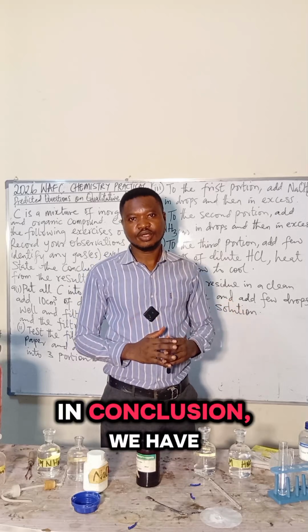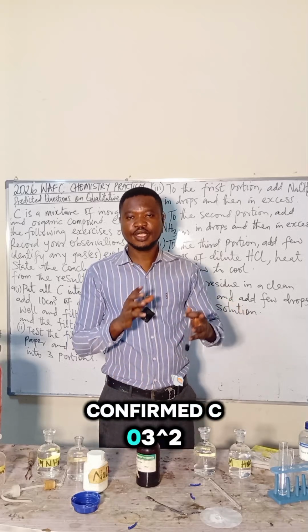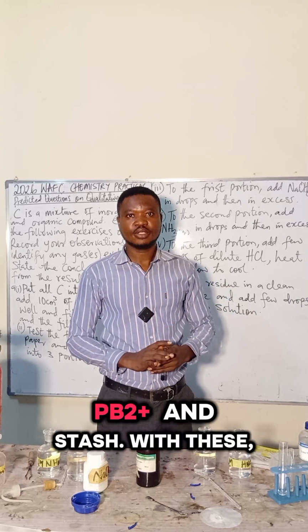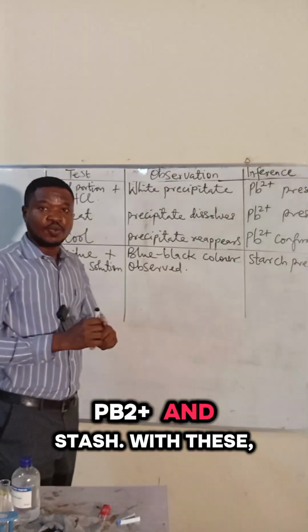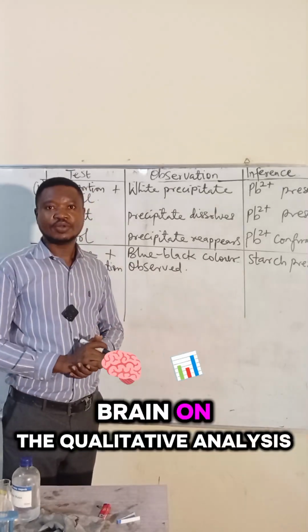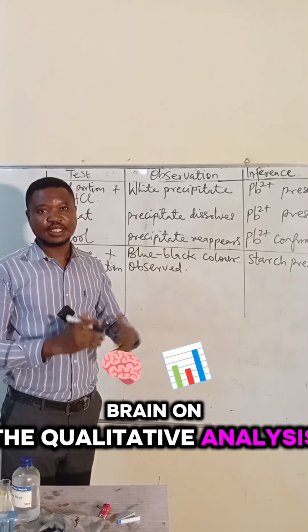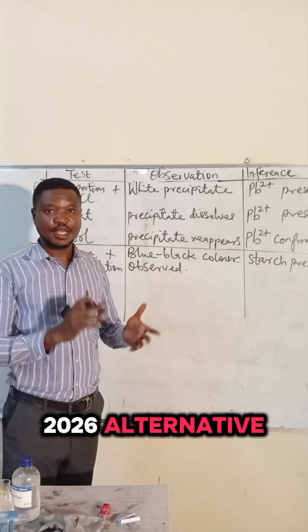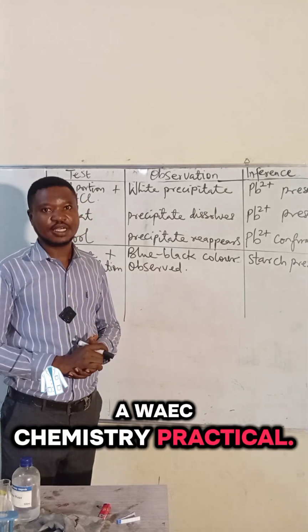In conclusion, we have confirmed CO3 2- ion, lead 2 ion, and starch. With this, I am sure that you can wrap your brain on the qualitative analysis aspect of 2026 Alternative A WAEC Chemistry Practical.